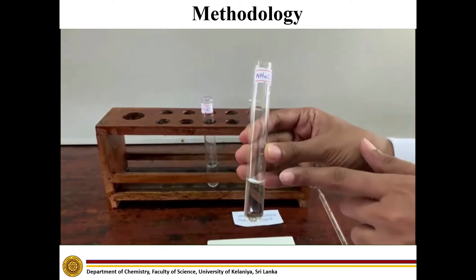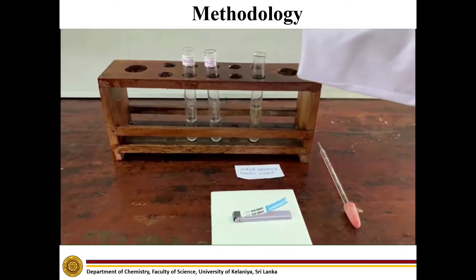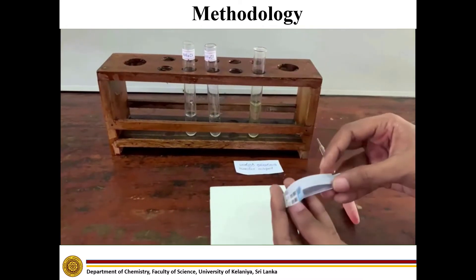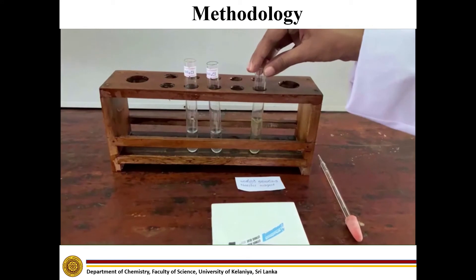For the third step, take a dilute solution of ammonia and test with litmus paper and a few drops of Nessler reagent.